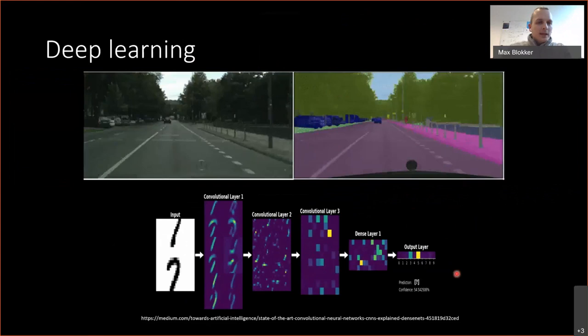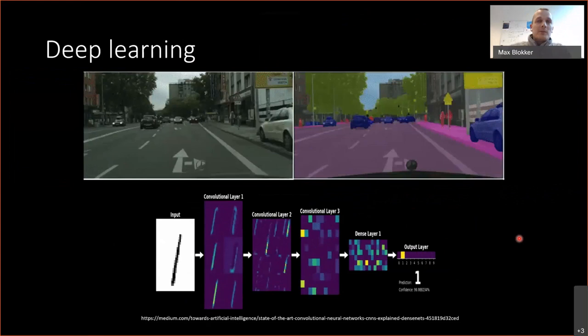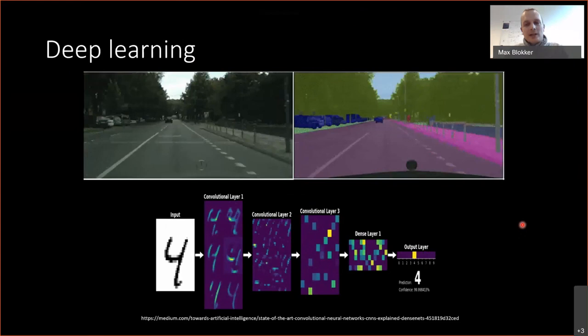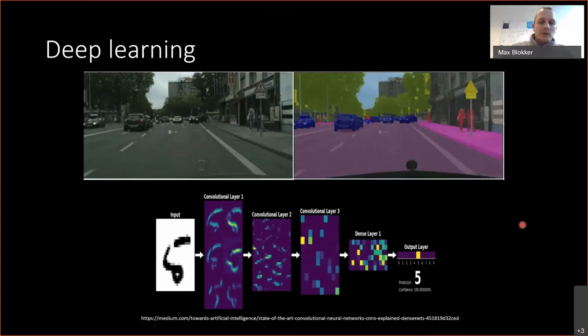And we turn to deep learning to achieve this goal because of the milestones in the image processing field, like self-driving cars. Deep learning is a subfield of machine learning, which is based on extracting features and learning patterns from data to perform tasks like classification, segmentation or super resolution.